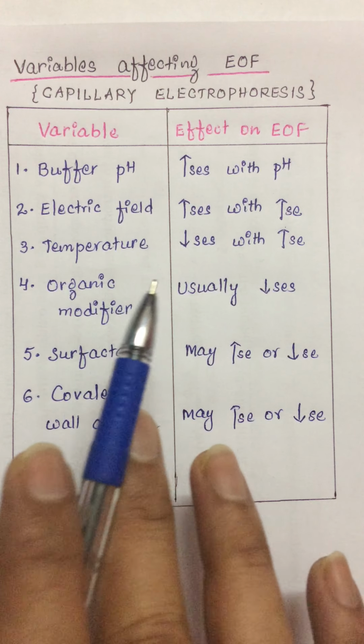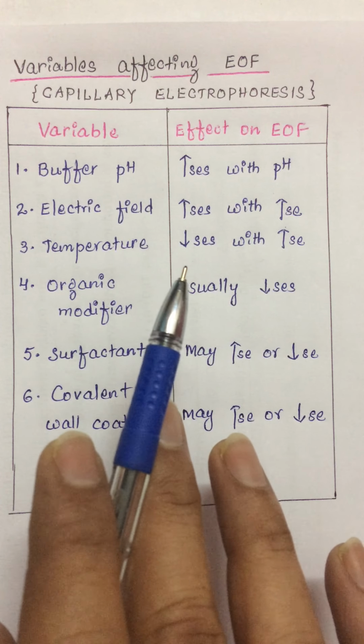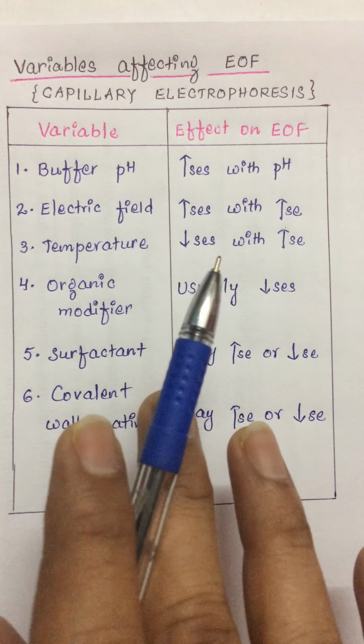And this is about capillary electrophoresis, one of the best separation techniques which is exponentially rising in the present era.